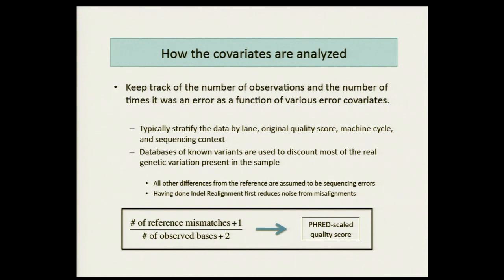So if you were to throw in like whether the machine operator had a cold that day, or whether they sneezed on the lane, then that would probably be independent of the quality score.